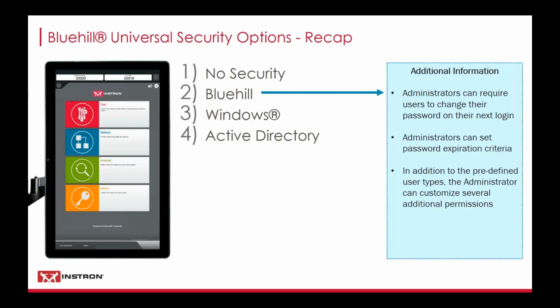But I just wanted to mention that administrators can force users to change their password and set password criteria because this differs from the Windows or Active Directory. Since those are linked to Windows and Active Directory, you have the password expiration criteria and the password length and character requirements as dictated by your IT group.